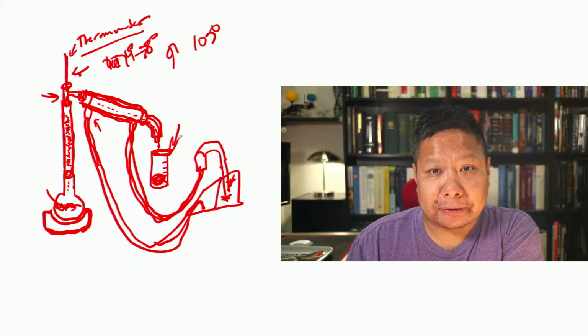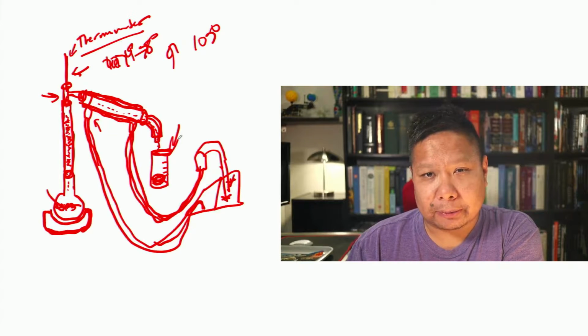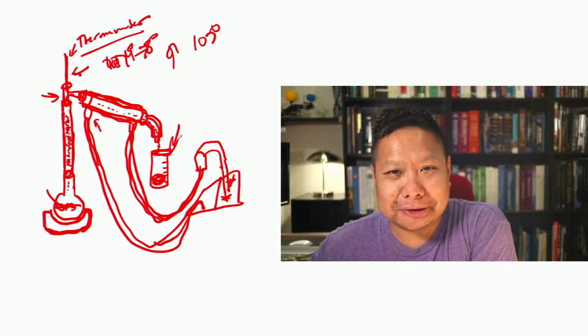One of the things to take note of, though, is that water has this thing called an azeotrope with ethanol, right? And so have you ever noticed when you go buy liquor at the store, like maybe at Specs or something like that? We have a liquor depot on the corner of the street near my house here, so you can just walk to the liquor depot if you wanted to. Dang, I wish I had a bottle of Everclear here I could show you.